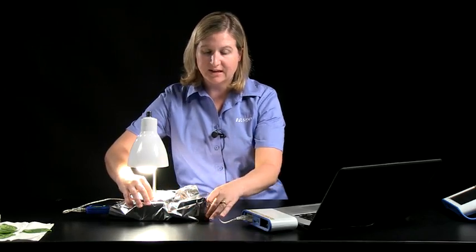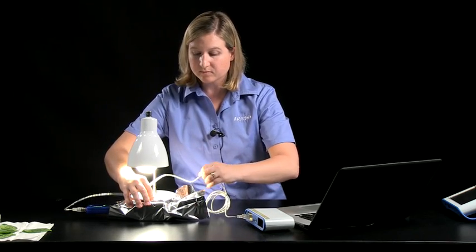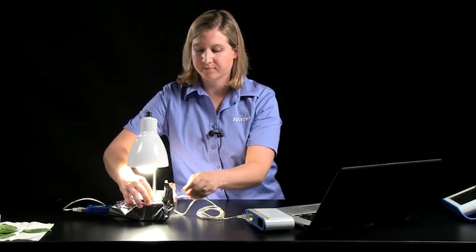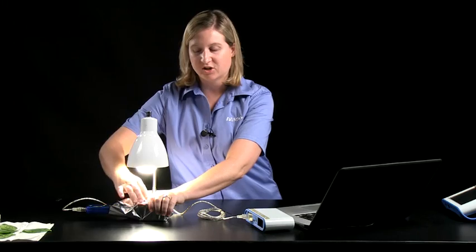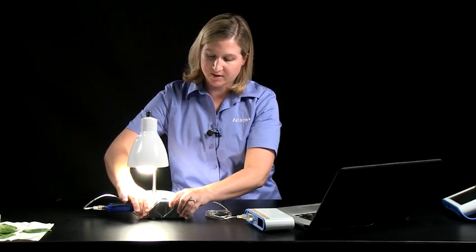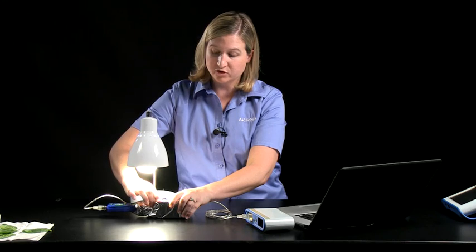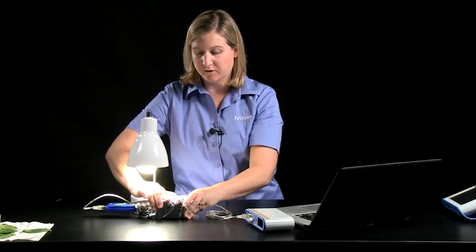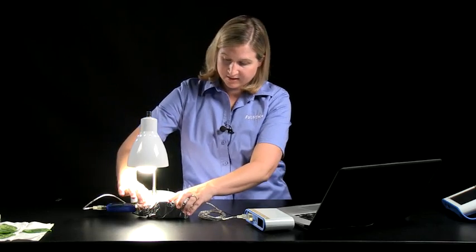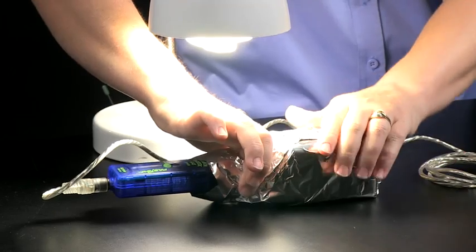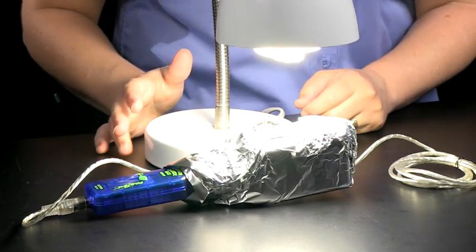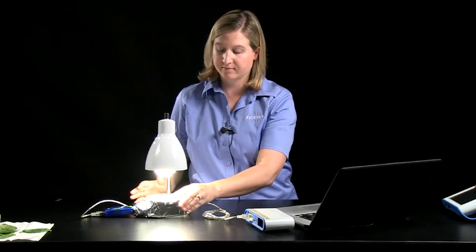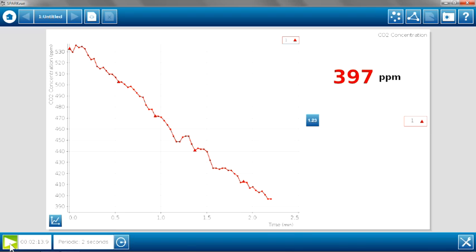Now you'll notice that I'm going to leave the light on. This will be a controlled variable. The compact fluorescent light should not provide too much heat to the system, but we'll leave it on just to control for temperature between the two parts of the investigation. So now that I've got the bottle sealed in foil so that the leaves are now in complete darkness, I'll leave my lamp adjusted just as before, and I'm going to begin data collection again just by clicking in the lower left side here.